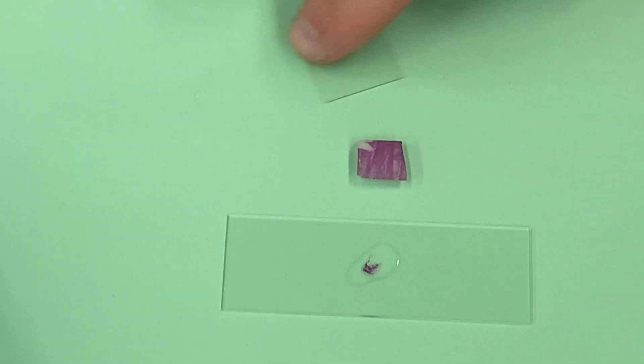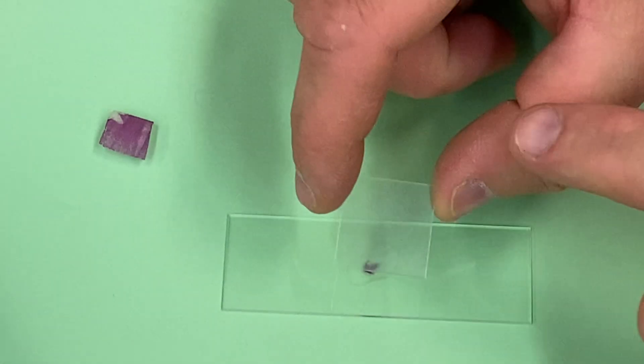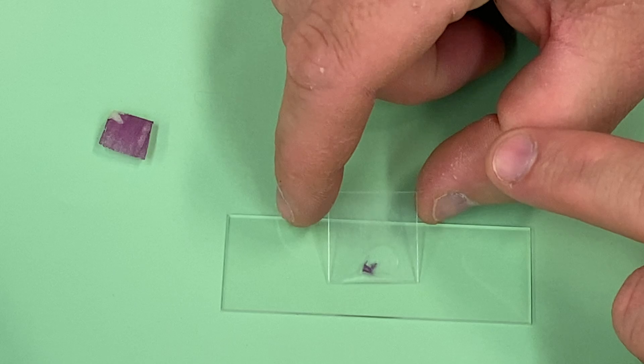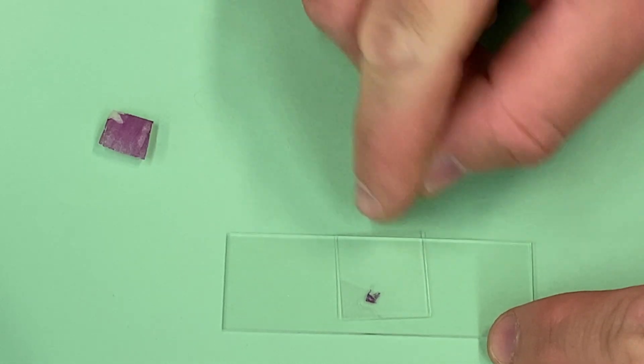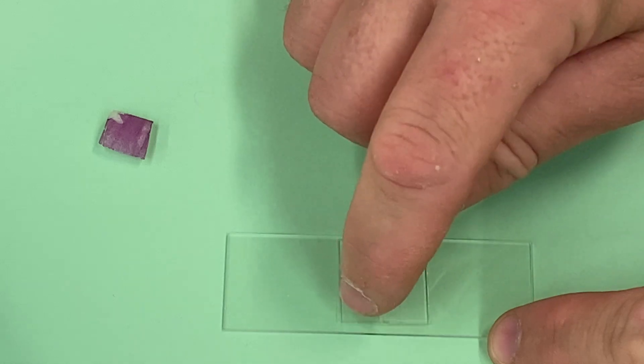And then a cover slip. Now the cover slip is going to protect the objectives of your microscope and also it kind of helps when you're doing the other portion of this lab, which is putting the salt water on.